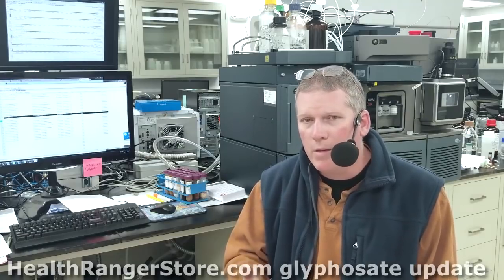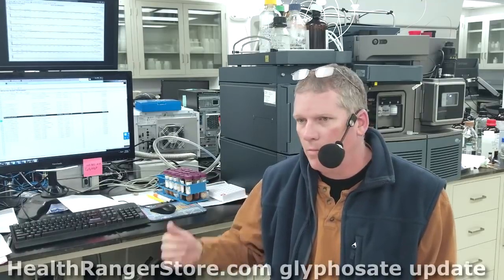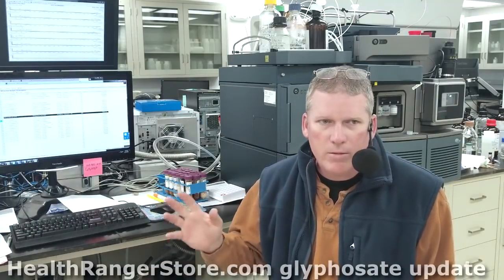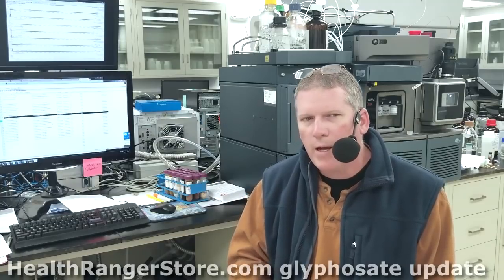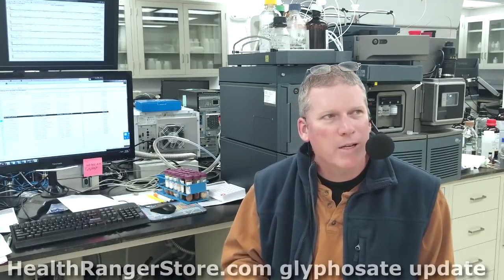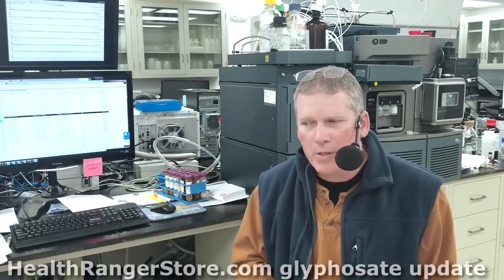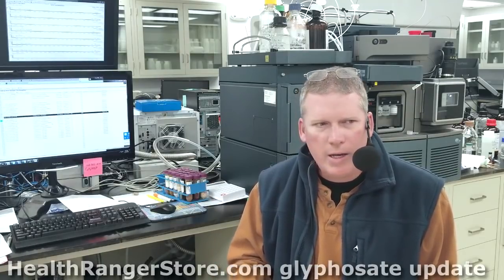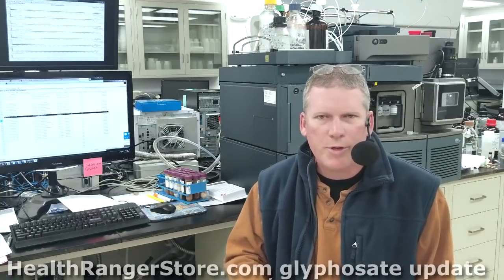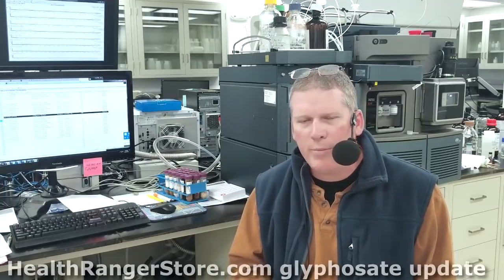This method is well documented, using chemistry that's nailed down, but we've actually improved the chemistry to have more consistent results. How do I even explain this? This chromatography is so complex. All the other scientists who have seen this have said this is the most complex analyte in all pesticides and all herbicides, and the chemistry is very fragile. You have to have exactly the right pH, exactly the right molarity of the buffer chemicals, exactly the right flow rates, the right column temperatures, everything.